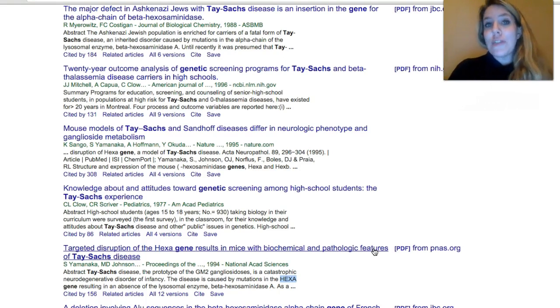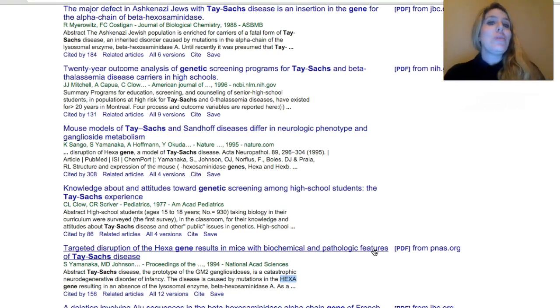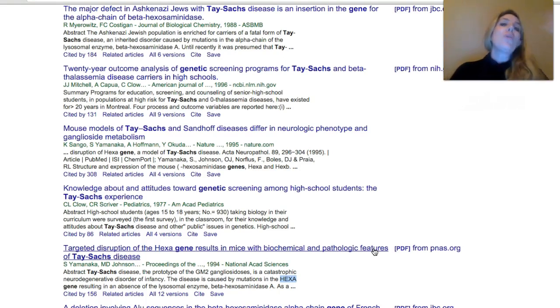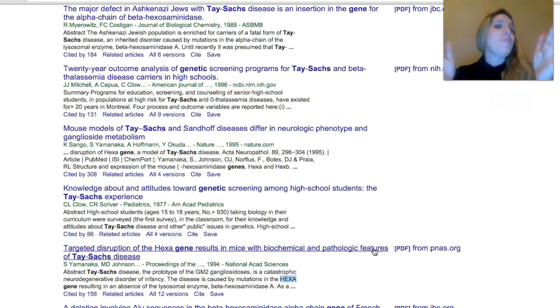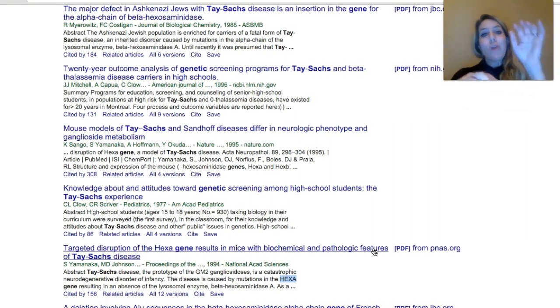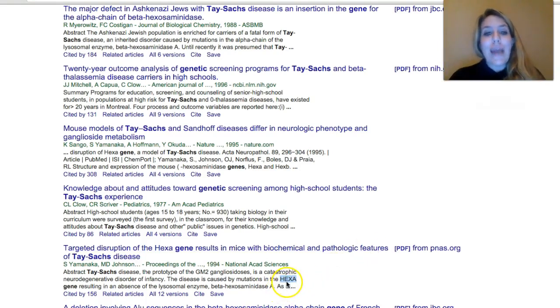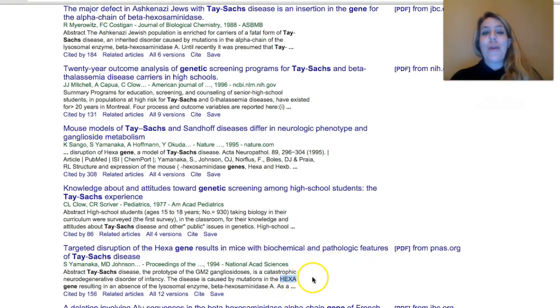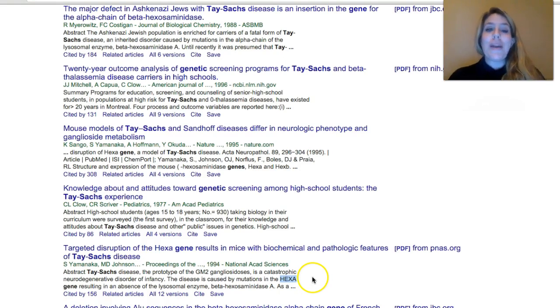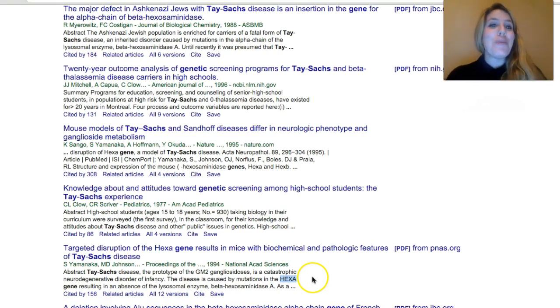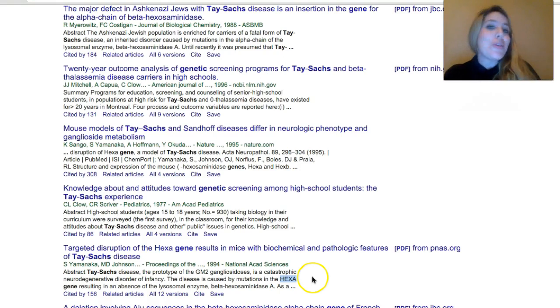So all I do is open up MEGA, query databanks nucleotide in the NCBI database, and I type in Homo sapiens and then capital H capital E capital X capital A. So that's just one example, but happy hunting.